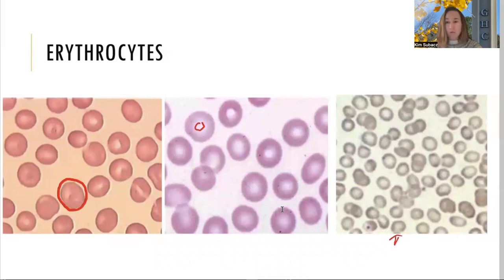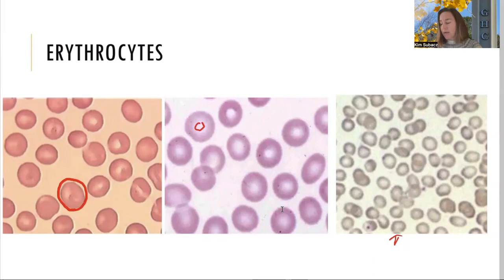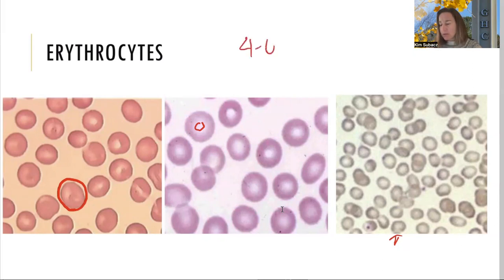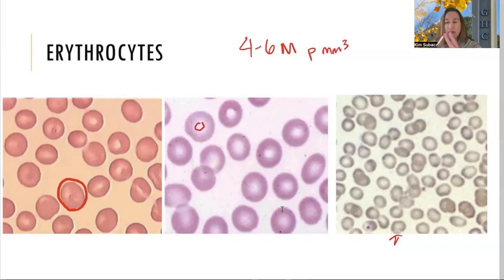Some slides look a little older and the pigment is faded, making them look more gray. I like to give you lots of different pictures of the slides because real life will have lots of different images. The erythrocytes' job is to transport gases — transport oxygen. Their numbers are four to six million per cubic millimeter.